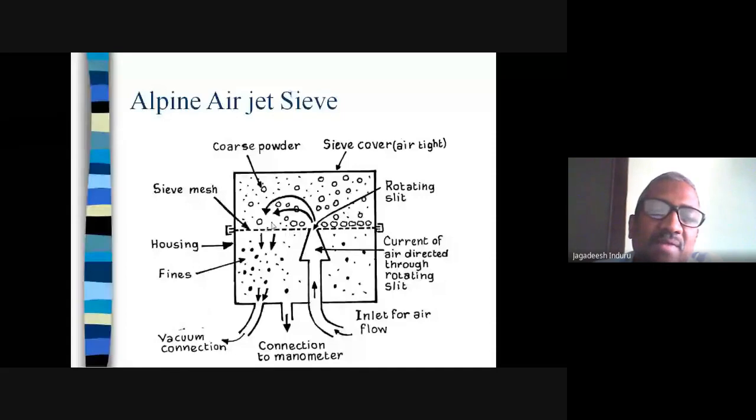Like that, we are going to repeatedly do this particular process to get multiple fractions separated from the mixture of powder. Now you may get the question, sir, the sieve shaker machine has one step, we are separating the whole mixture into 7 fractions. Here we are stopping the machine 7 times, we are repeating for the 7 sieves. It is a cumbersome process. Then why should we use it?